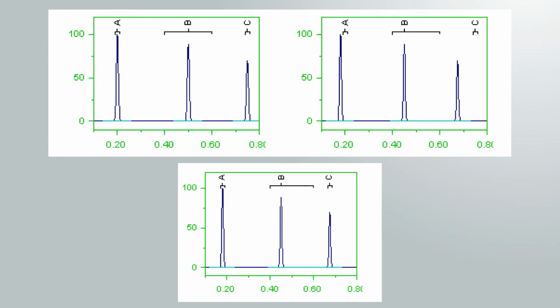The retention time scheme fails when the reference peak is absent, or the wrong peak is used as the reference. To prevent windows from being moved improperly, the reference peak area reject threshold should be set to a value large enough to prevent noise peaks from being considered reference peaks, but not so large that the real peak fails to be considered. In this way, if the reference peak is absent, the windows will remain in their original positions.